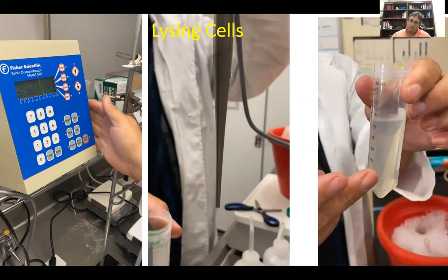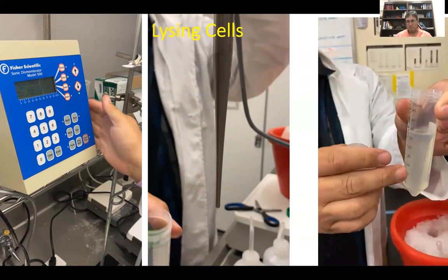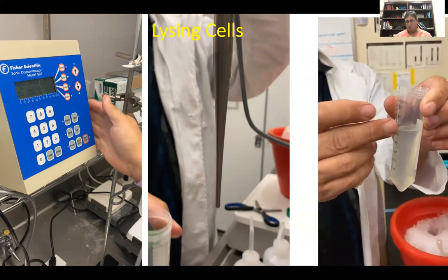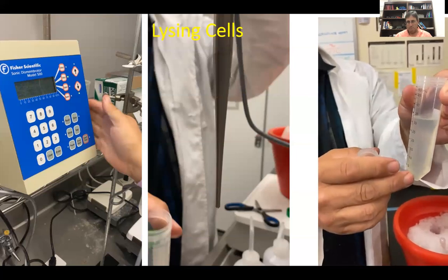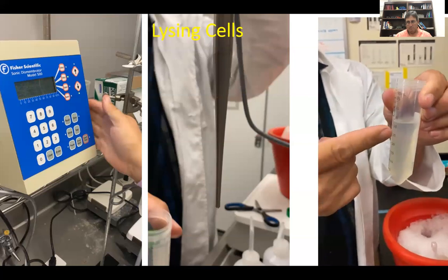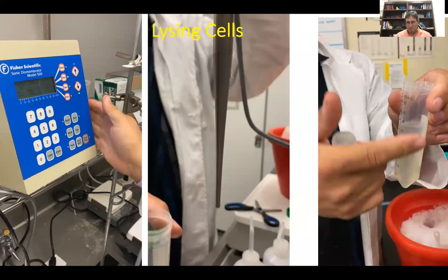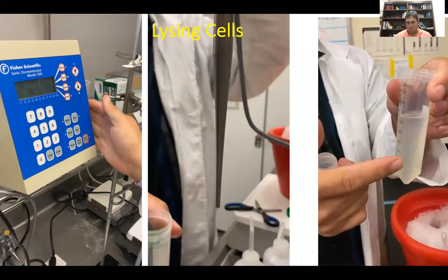This is ready for a column. If it was cloudy, it's because there's some pellet left inside here, and it needs to be respun. Never apply this lysate to a column if it's cloudy. It needs to be clear. A color from the bacterial lysate's fine, but it needs to be clear, and cannot have particulate matter making it cloudy.